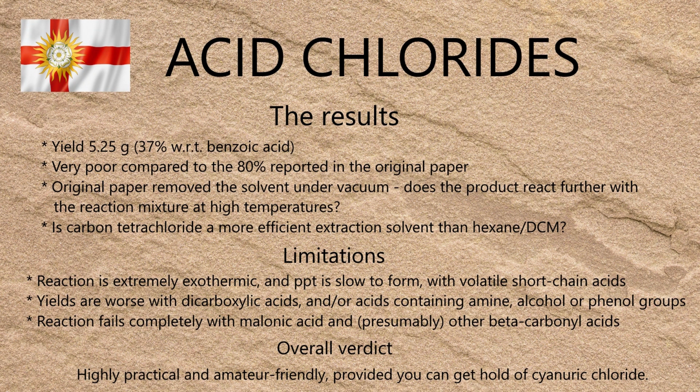Overall, this is a very practical and amateur-friendly alternative to the textbook method, even if the yield I got was poor. I find it strange that it's not more widely known, but then again, acid chloride formation is far from the only reaction where the textbook method is impractical or unnecessarily hazardous.